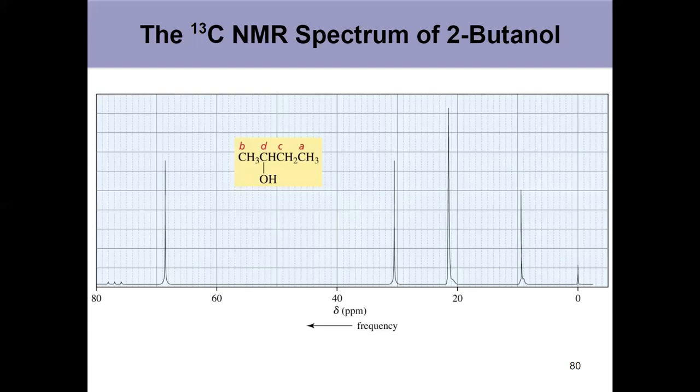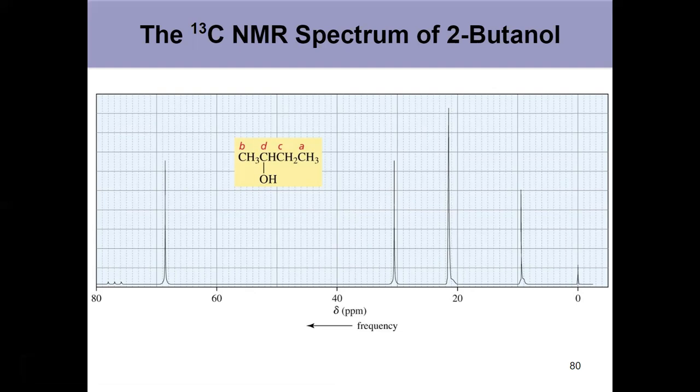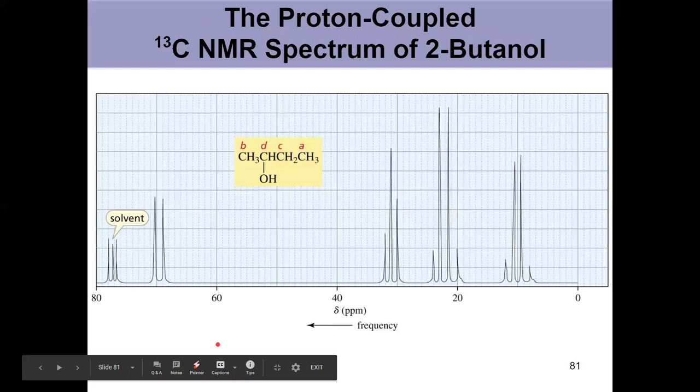There are some factors. If it's got a substituent, is it electron rich, is it electron poor, that can affect the signal frequency. And so carbons kind of get the same pattern as hydrogen in terms of where they're appearing. And we also notice everything here is showing up as a singlet. We don't have any splitting to worry about because it's just statistically improbable. Keep in mind, this is dealing with carbon-13, and the chance of having 2 carbon-13s right next to one another to split is incredibly low. And while you could set it to couple with hydrogen, that is one method, it's typically not done. This is usually all we're saying with carbon NMR: 4 peaks, 4 unique carbons.